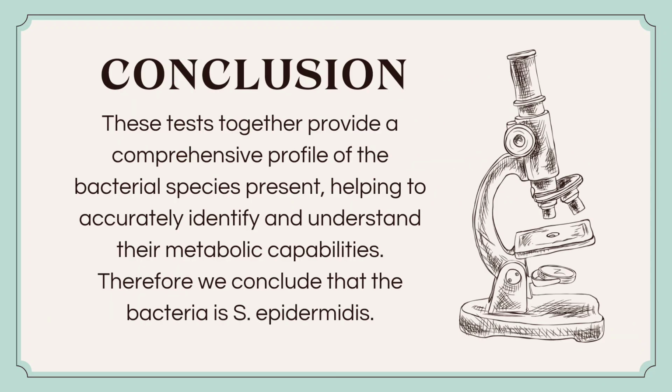To conclude, these tests together provide a comprehensive profile of the bacterial species present, helping to accurately identify and understand their metabolic capabilities. Therefore, we conclude that the bacteria is the Staphylococcus epidermidis.